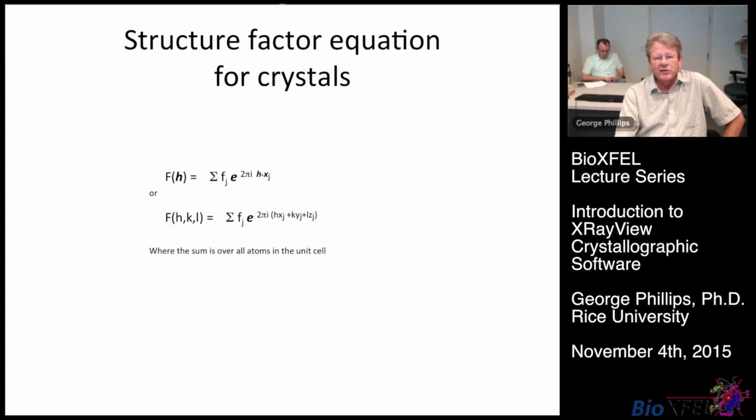Because we've imposed the periodic boundary conditions, you only have to sum over the atoms in one unit cell.